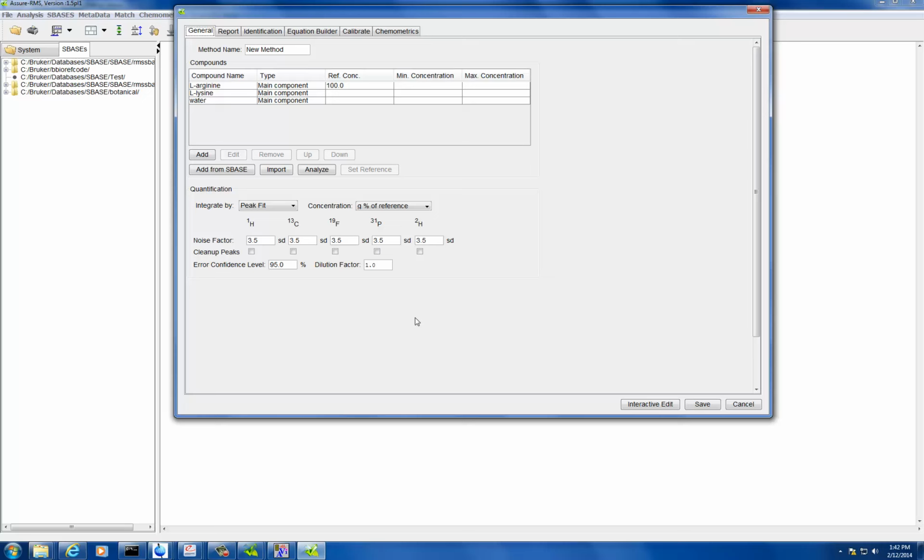Well, for this method, we know what the main component is. If you don't know what it is, then more likely you will run it without a method in the beginning, just the solvents. You can run just the solvents, for sure. If we run something completely fresh, then no, just the solvents. It's hard to pull in any compounds.